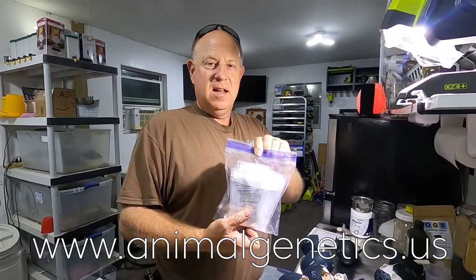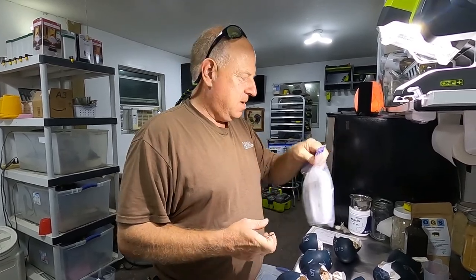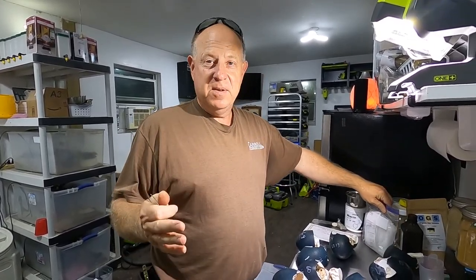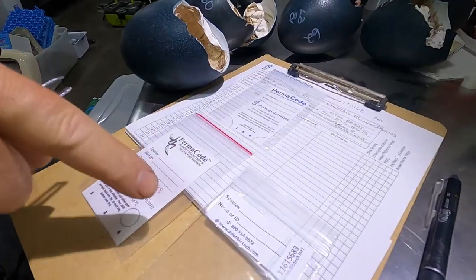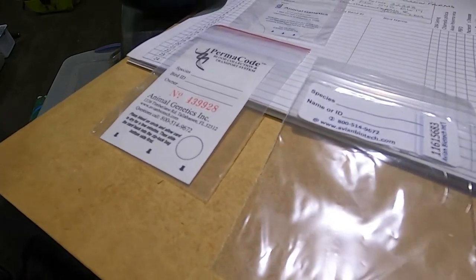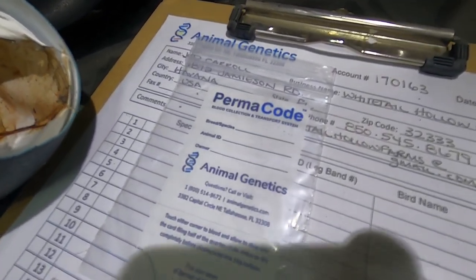The first thing you need to do is call Animal Genetics and get sample bags sent to you. You could probably make your own, but it's much easier with their sample bags. Here are the three different kinds that we have. They all kind of accomplish the same thing. Some of them have numbers on them, some of them do not.